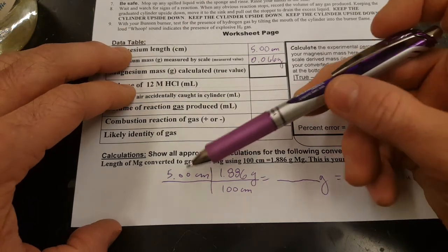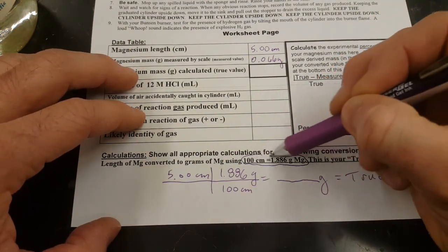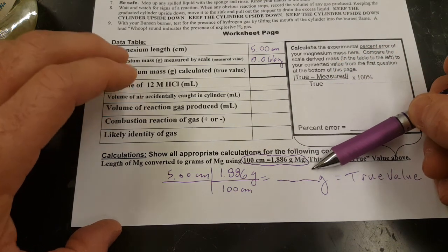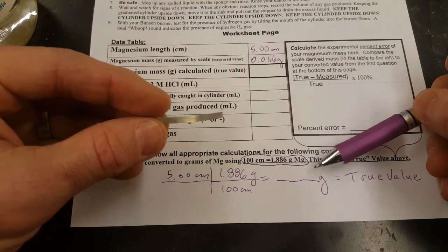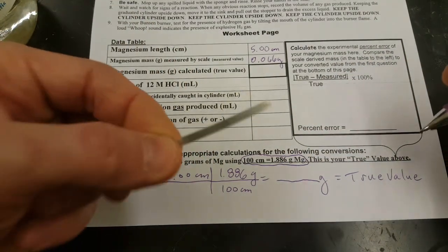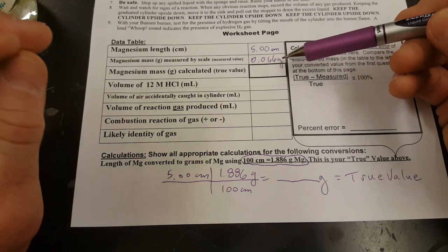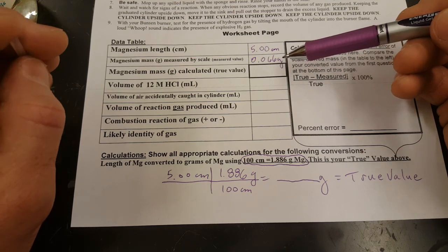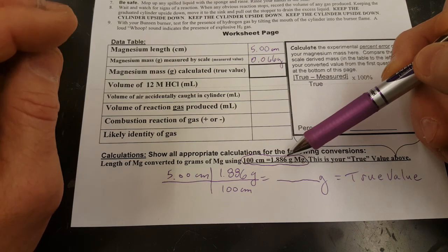All right, from that length calculation, and then using the length to mass ratio given from the long coil of magnesium, I can get the mass that the 5.00 centimeter magnesium length should be. That's our true value. Our measured value is up here. And we're going to try to see, well, how wrong is the 3 decimal scale compared to the 5 decimal scale that I got this value from.